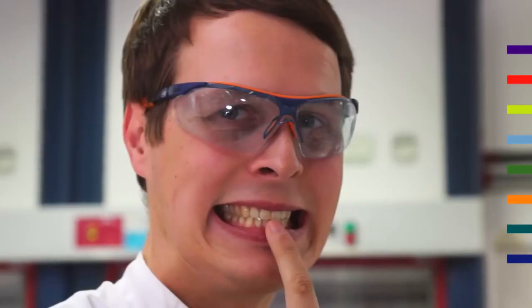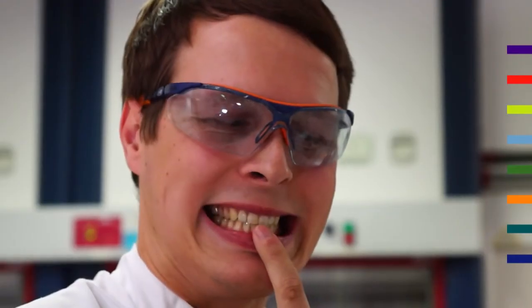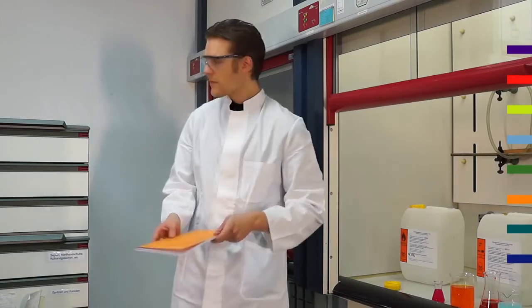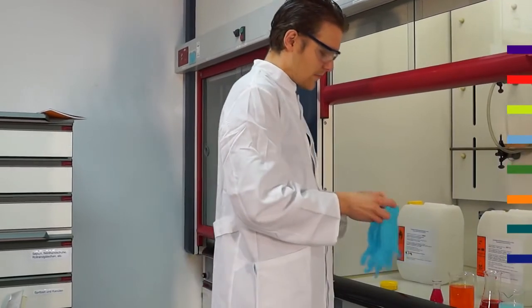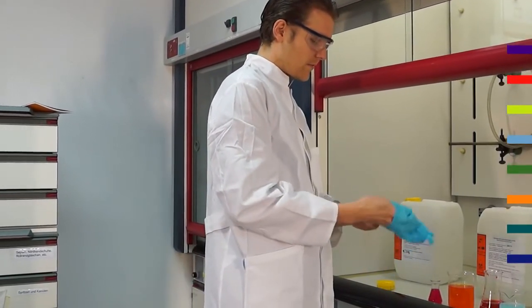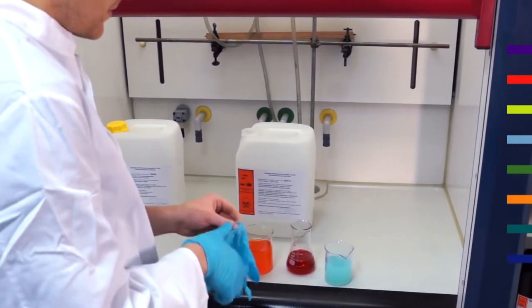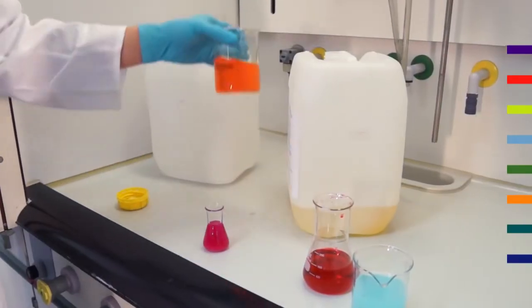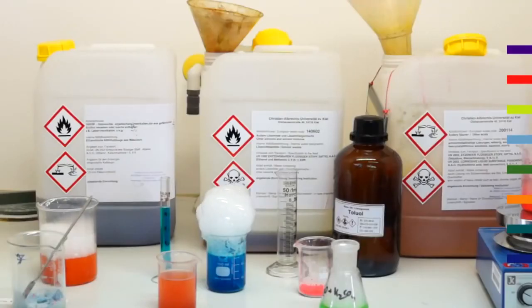Whoever works with chemicals should also think about their appropriate disposal. Always remember, clean up as you go along. In a laboratory, there will be dangerous and toxic waste, which requires separate waste disposal to protect us and nature. For this reason, there are special containers in which the waste is collected and disposed of. How you should dispose of a chemical can always be found in the safety information sheet.